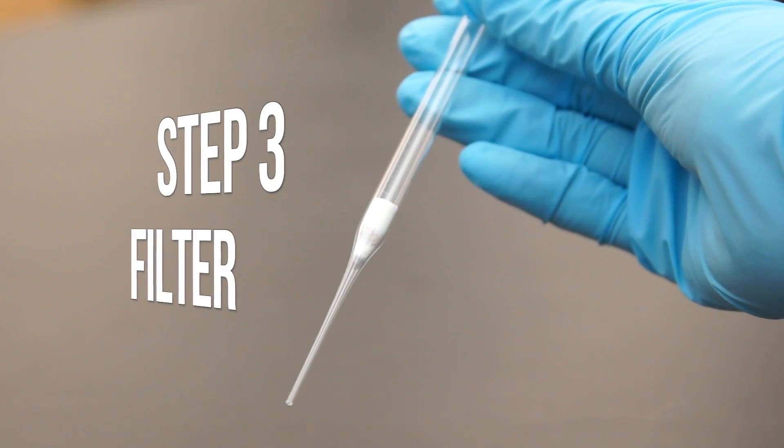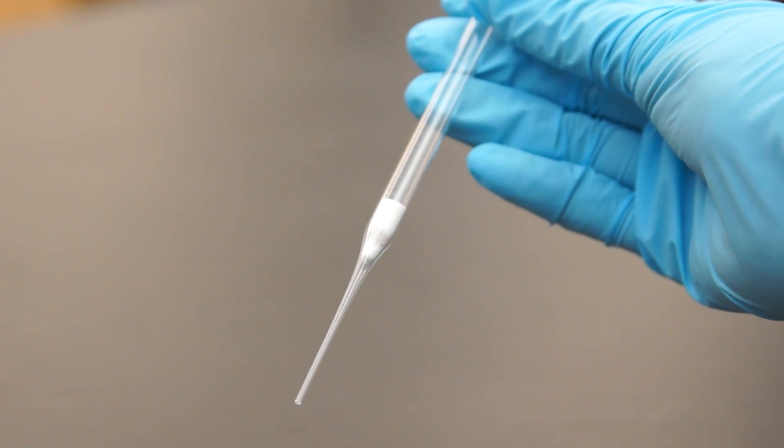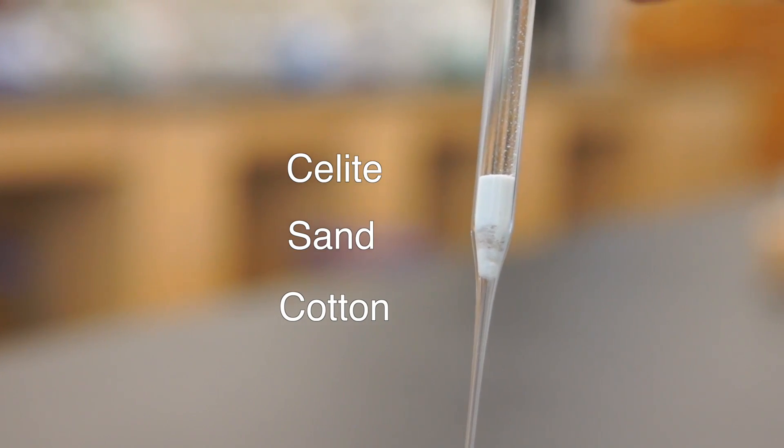The third step is to filter your sample. Do this if you have any impurities. You can use a cotton sand or celite filter as shown here.